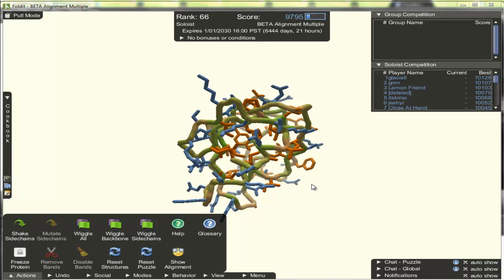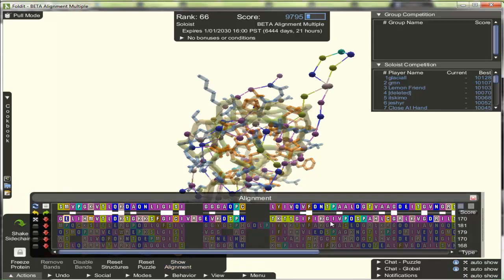Hi everyone, this is going to be a quick video on how to do partial threading in Foldit. First thing you want to do is bring up the alignment panel.